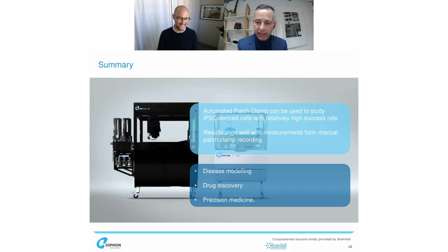So this goes to Hi. There seems to be a shift in the voltage dependence of the Nav currents going from the automated patch to manual. If that is correct, can you comment on why this might be?